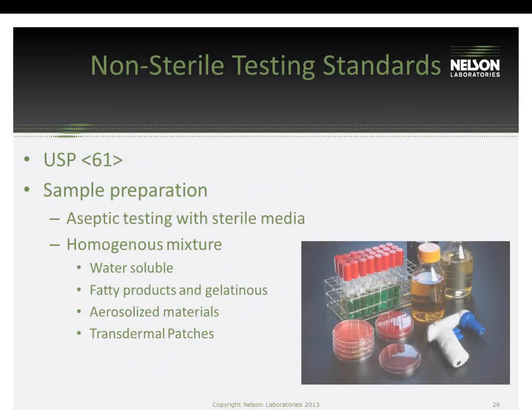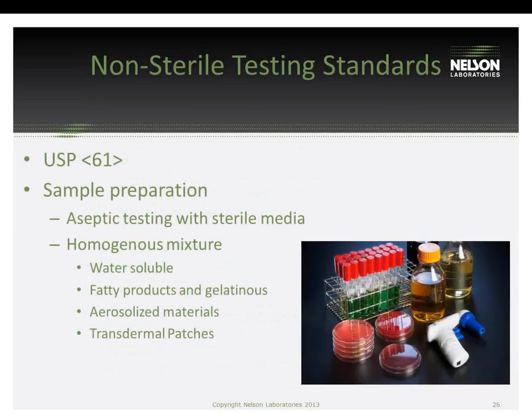So for the preparation, again, the sample is prepared in the sterile broth, and the goal is to get a homogeneous mixture to ensure that a representative amount of the sample is tested. For water-soluble products, not too much of a big deal since we're using water-based media. But for fatty products, gelatinous products, aerosol materials, there are some methods to get those to dissolve, or, for example, with transdermal patches, more of an extraction is performed.